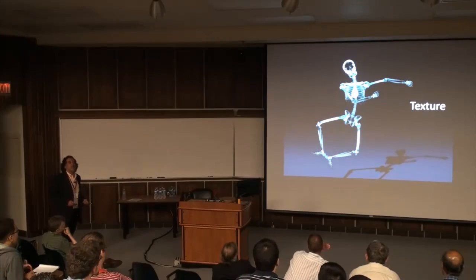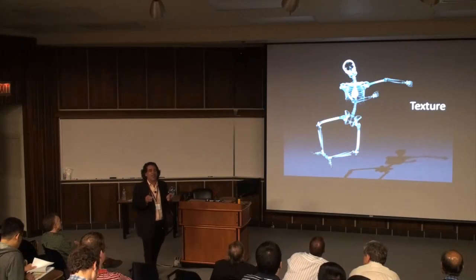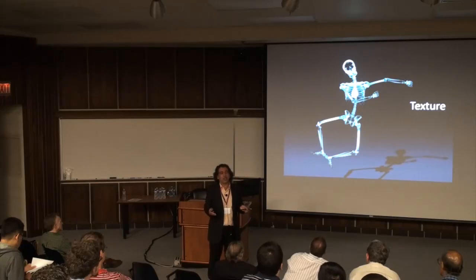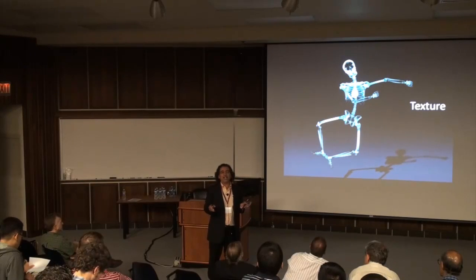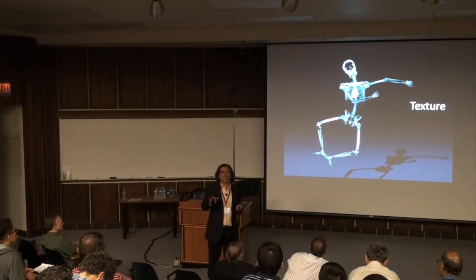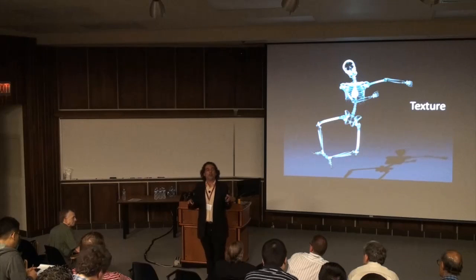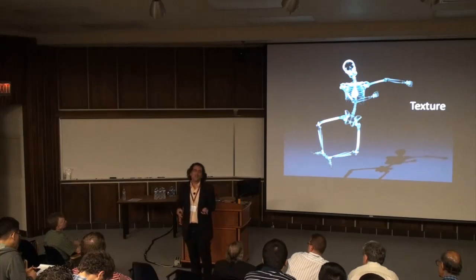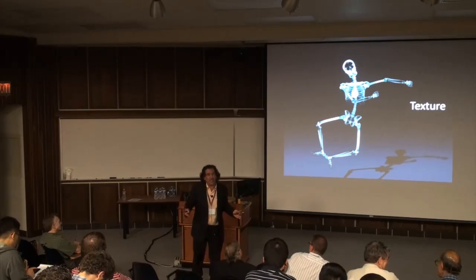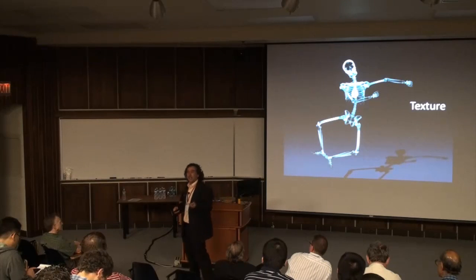Now, texture. We talk about grains being random or being oriented. Texture deals with this. You talk about the grains being random, but how many grains are actually oriented or not? Hopefully, right now, if you guys were grains, you would be textured, looking at me. There are a few random ones, but that's fine. But basically, in the coffee break, everybody will be looking in a different direction. Of course, unless Paris Hilton walks by, then everybody will be looking there. But otherwise everybody will be randomly oriented. So this is basically the texture, the orientation of the grains.